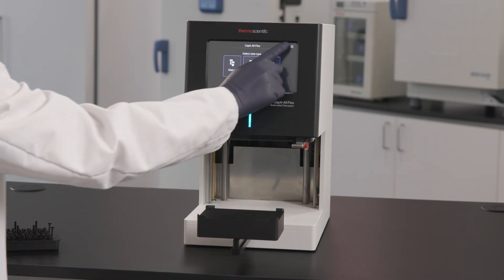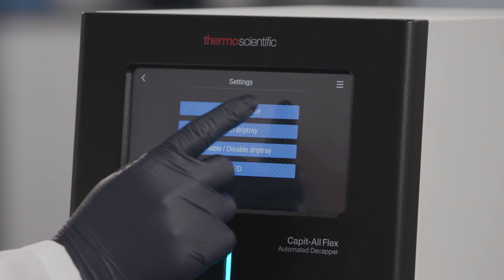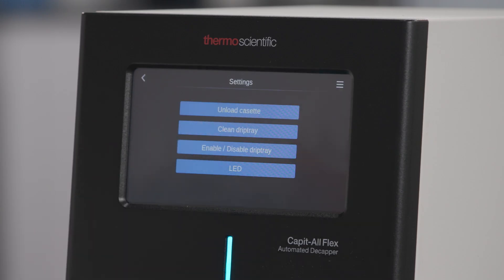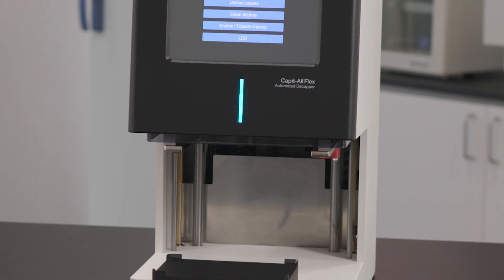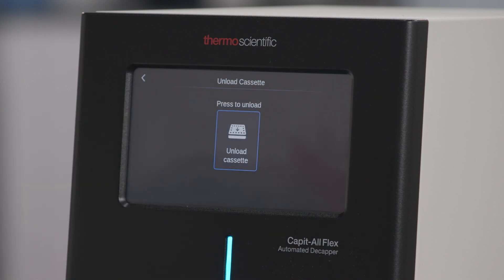If you would like to uninstall the cassette in order to use a different one, go to the main menu and select Settings. Before pressing the Unload Cassette button, make sure there are no consumables loaded in the nest. Wait until the process is complete before removing the cassette.